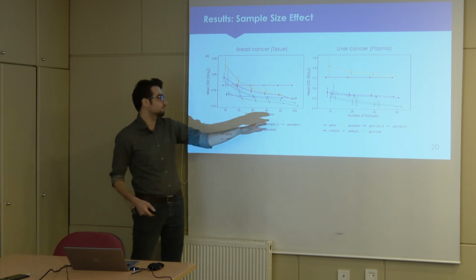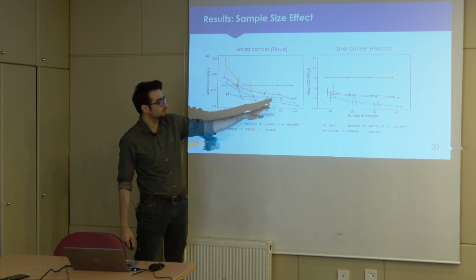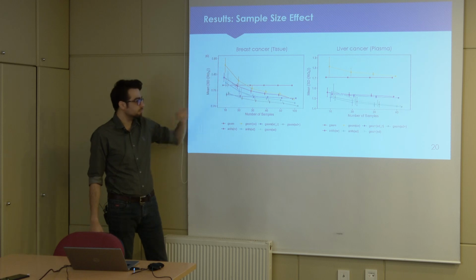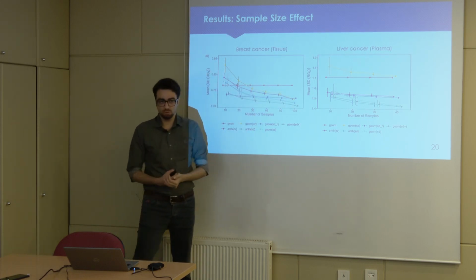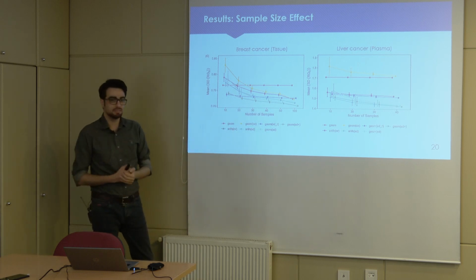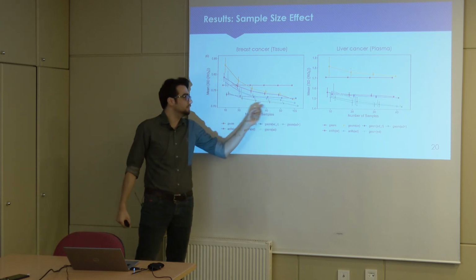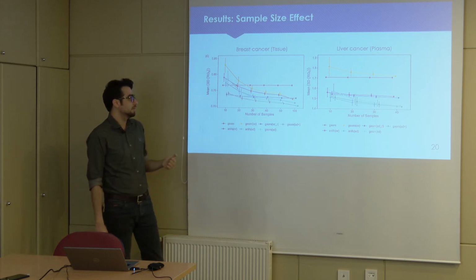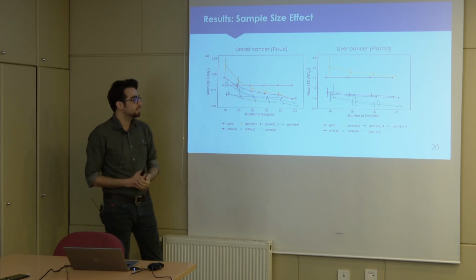It turns out that for a lower number of samples, some of the proposed methods like the GeoMCV just get worse, and this red one is the usual mean, which isn't affected by the number of samples because it's not different in different conditions. And the green one is our proposed method, which you can see still outperforms other methods.